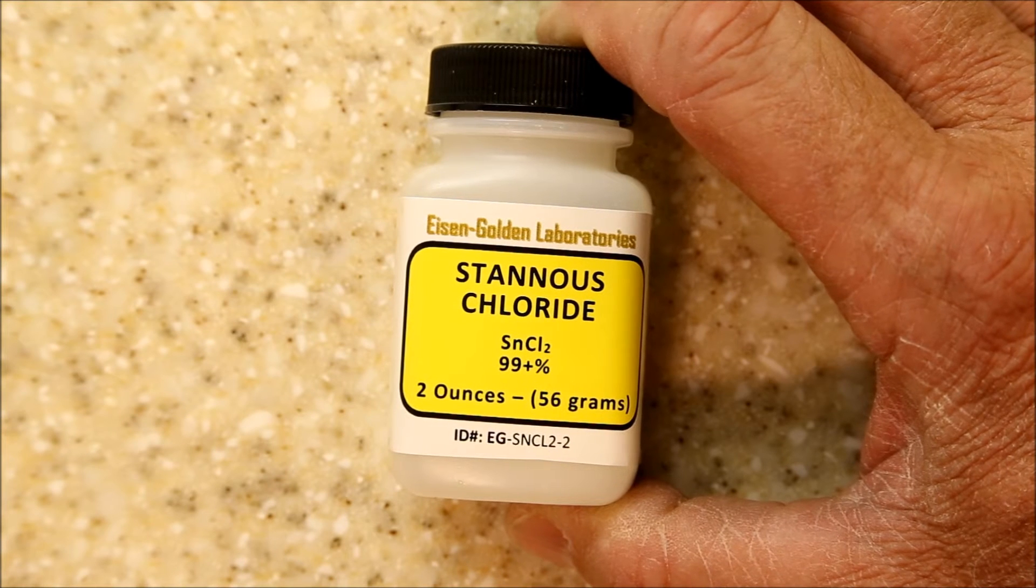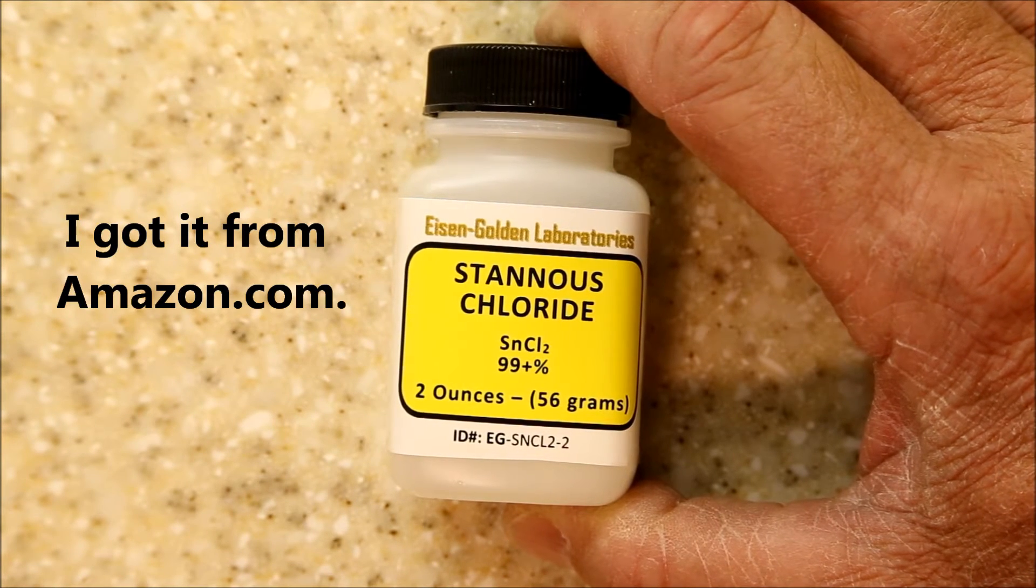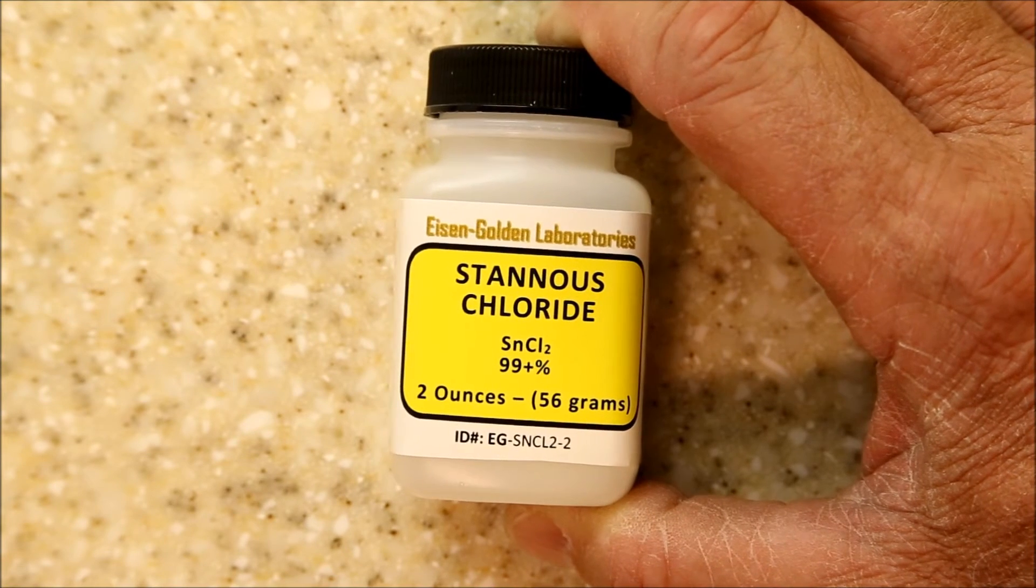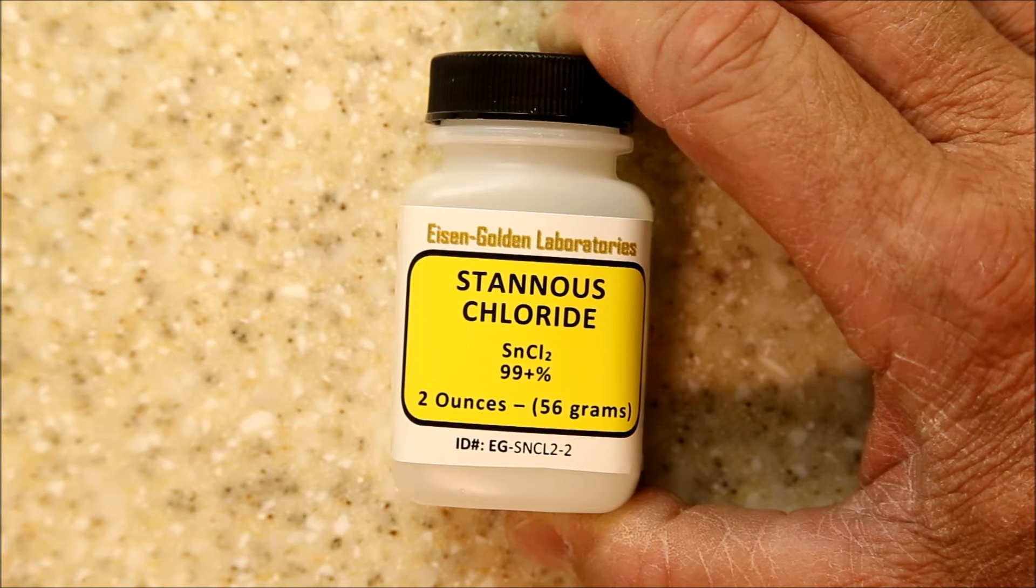Now this was $20 in 2016 for two ounces. That seems a little expensive, but you don't need very much of this, and this one two ounce bottle could easily last 40 experiments.